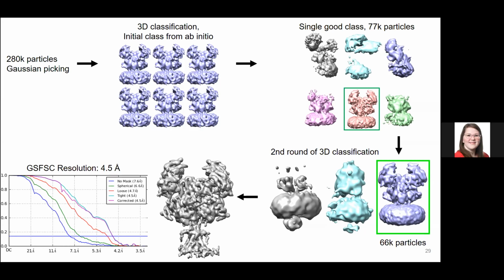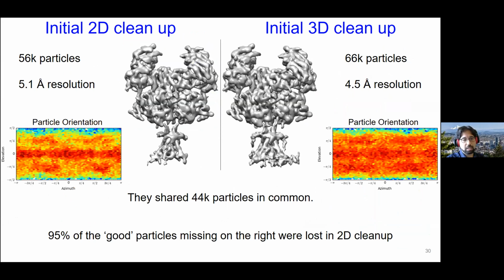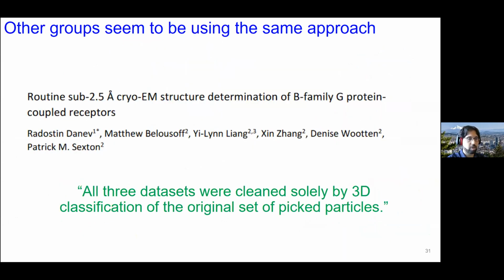In terms of pursuing higher resolution, how many particles are reasonable? Very good question. The paper that I talked about here on bioRxiv goes through and talks about how many particles they had. And I think there is a different paper on bioRxiv. If that person can email me, I can direct them to that paper. That paper talks about individual elements, such as using an energy filter, whether that helps or hurts, and using a Volta phase plate, whether that helps or hurts.